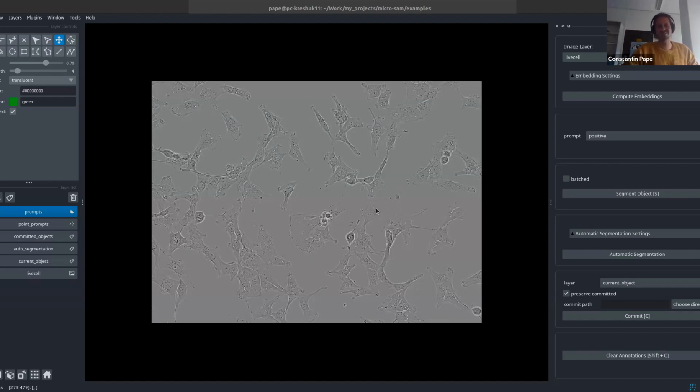With Zoom running, unfortunately, it will take a couple more seconds because my CPU is quite busy, but we'll see it working here. And now it's done. So this happened once with this model for this image, and it will not be recomputed until we tell it to. Then we can do the annotation. We have these napari layers here in order to provide the inputs to the model.